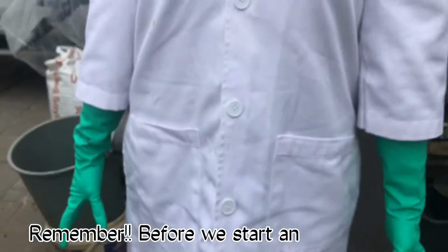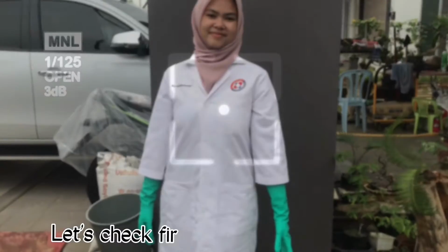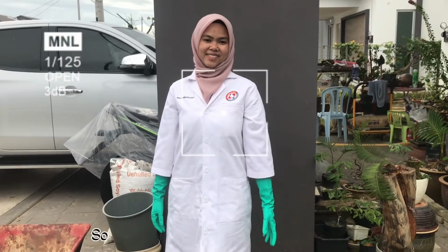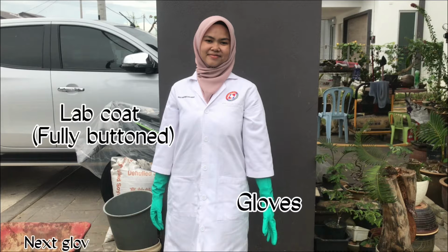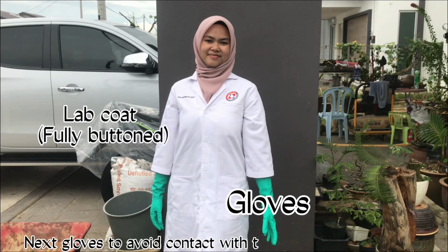Hello everyone, remember, before we start any experiment, let's first check the appropriate lab attire. So, I wear a lab coat fully buttoned, and next gloves to avoid contact with toxic chemicals. So, if we are ready, let's get started.